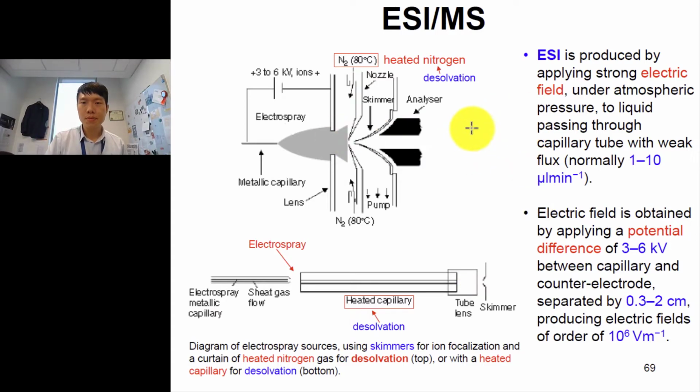Another picture. Again, this is non-colored because if you're asked to sketch it out, I think you should be able to draw a schematic diagram of the different parts that constitute the electrospray: where the capillary is, where the nebulizer comes in, and where the aerosol gets ejected.